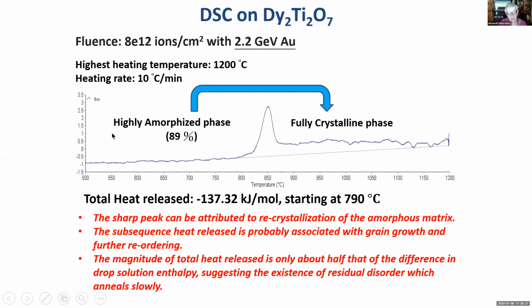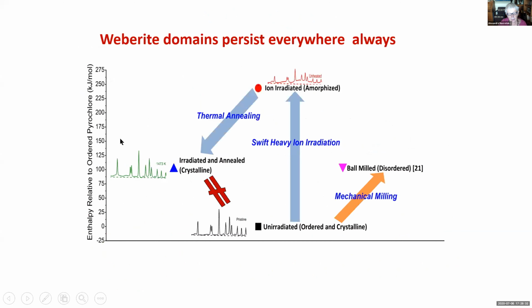There is a significant amount of short-range order, and I don't think I've got a slide on that. No, I don't. But basically what has been found by Lang's group, and they're continuing to refine the data, is that you get a formation of domains, nanoscale, perhaps 10 nanometers, not more than 50 nanometers, more or less randomly distributed within either the amorphous structure or the pyrochlor structure.